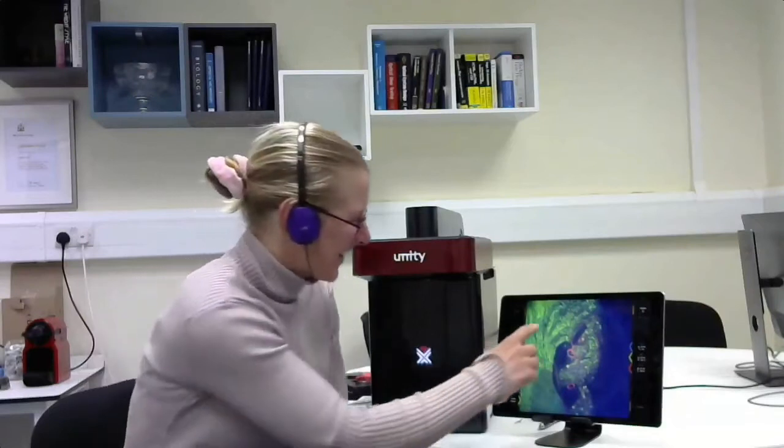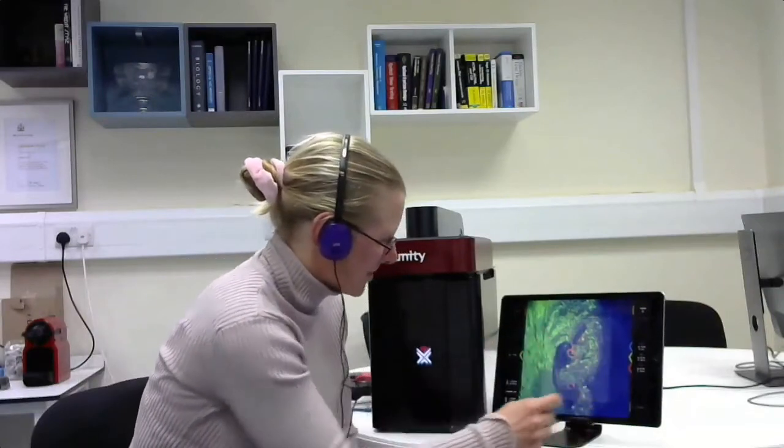The maximum number of tiles is 386 tiles, which is 224 - nearly the whole field of view. So that's a 4mm by 4mm tile, which should cover most samples.